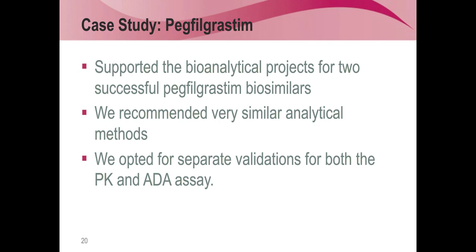And as a last part, I just wanted to give you a little case study on one of the biosimilars we were working with, and that was Pegfilgrastim. We supported, of the 4, I think, successful Pegfilgrastim biosimilars which are on the market now in the European Union, 2 of those, and we recommended, of course, very similar bioanalytical methods to both companies. But we opted to validate everything again for both companies, so that they could be sure that their compound is really performing as they expected in the bioanalytical assay.